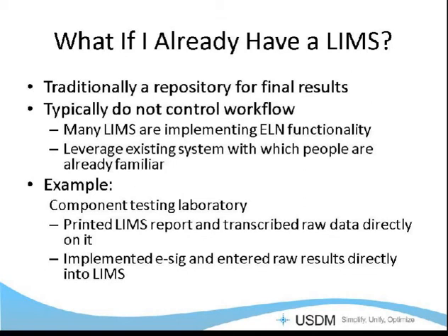Generally, at least as I have seen it, LIMS takes the role of being basically a final repository of results. So people will do their analysis, write down their raw data, do their calculations in their notebook. Sometimes LIMS will handle that. A lot of times they'll do it in a notebook because they want to find out right away if things pass or fail. And they take the final results and they re-enter it into LIMS. Someone else will approve that, and then it gets reported.